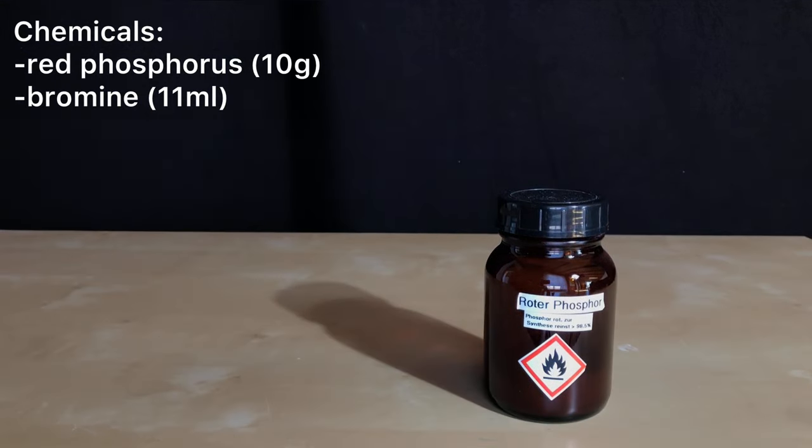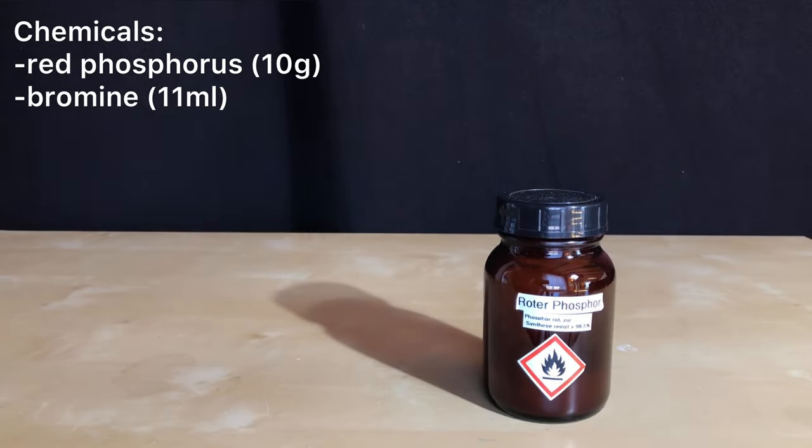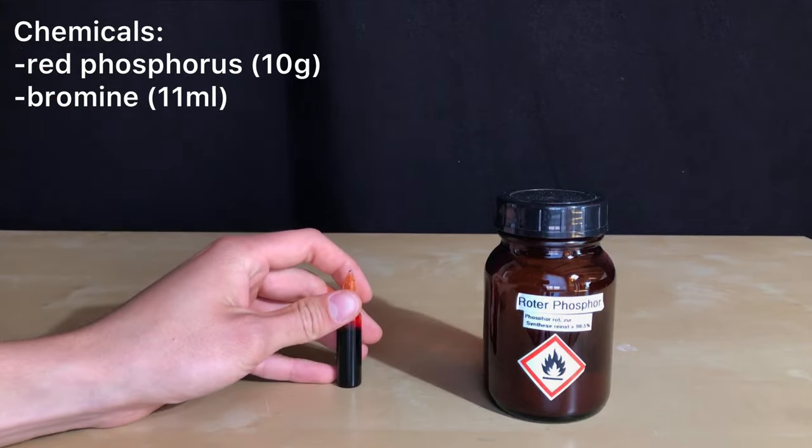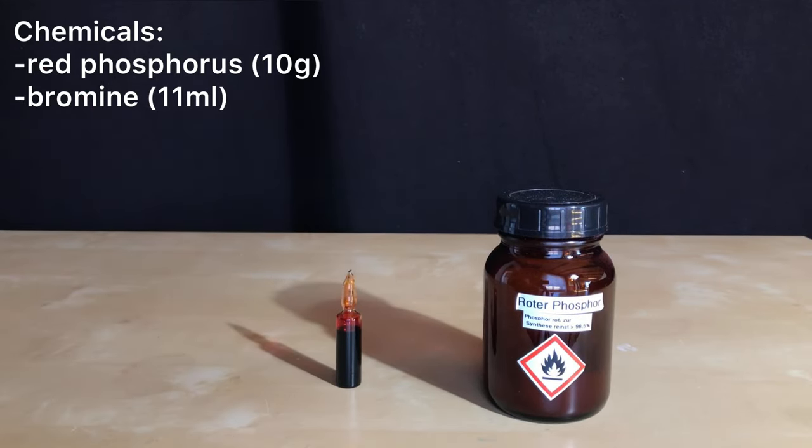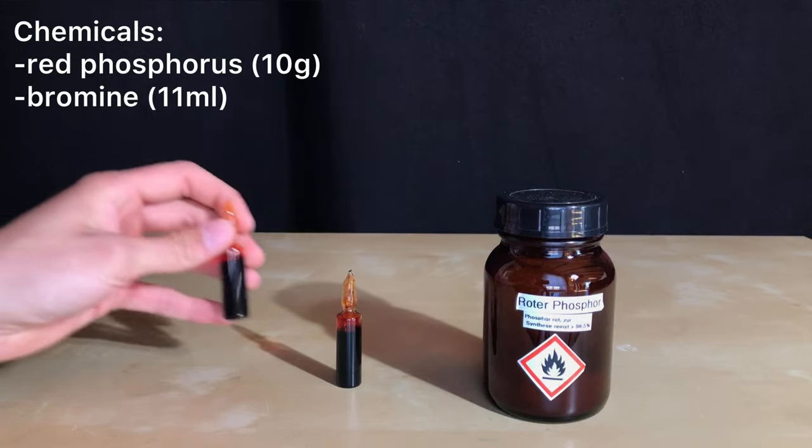Only two chemicals are needed: 10 grams of red phosphorus, which is a huge excess, and about 11 milliliters of elemental bromine. The last bromine I have will be used for this.